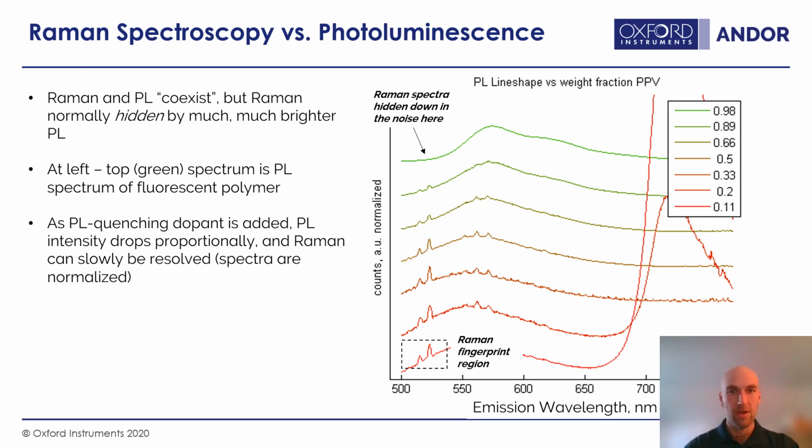So again, here, this is the undoped, and what we're doing in this measurement is adding a quenching molecule that has its own fluorescence in the near IR. What it does is, as you add it, it steals the excitation. When you make an excitation in the PPV, it will grab that excitation and shut off that pathway of emission in the green to red. So the more that we salt in this dopant, the more that it quenches the photoluminescence.